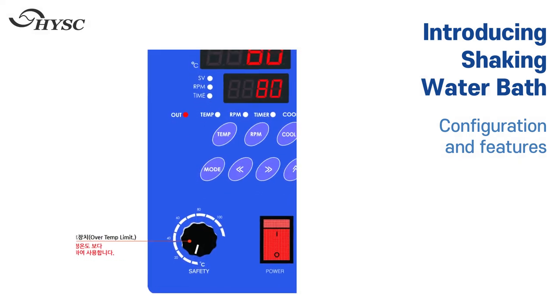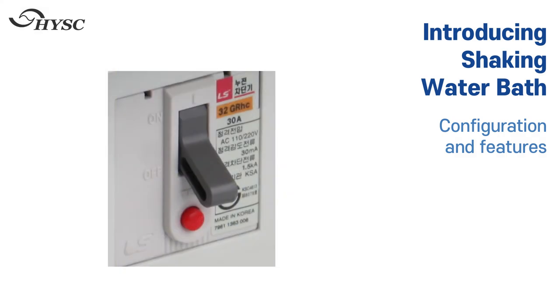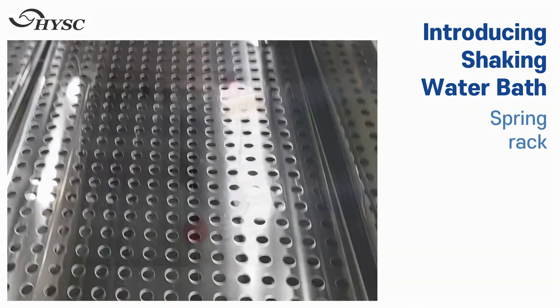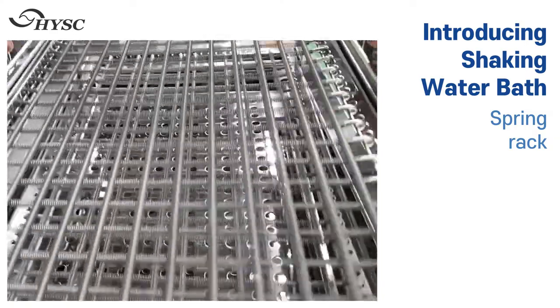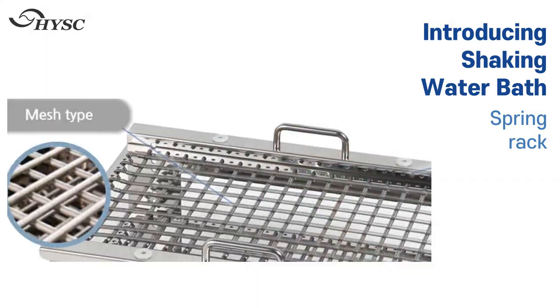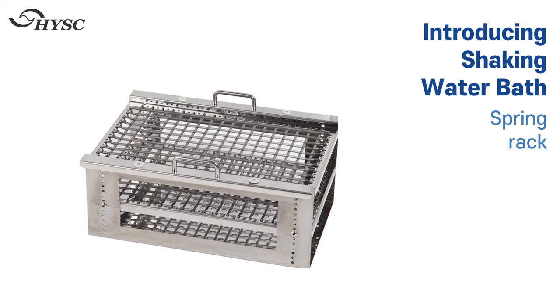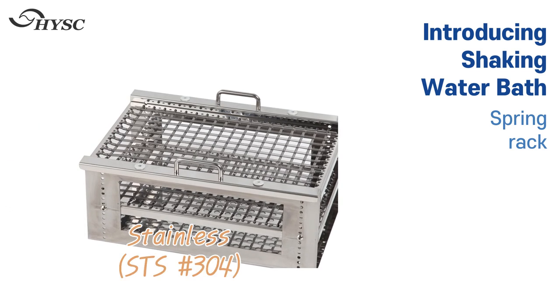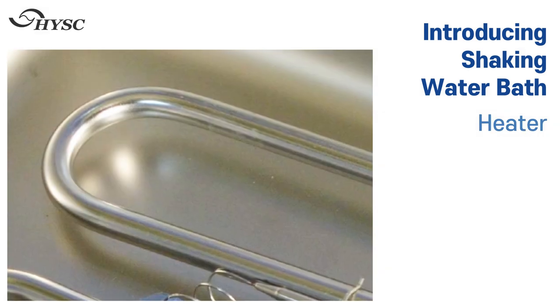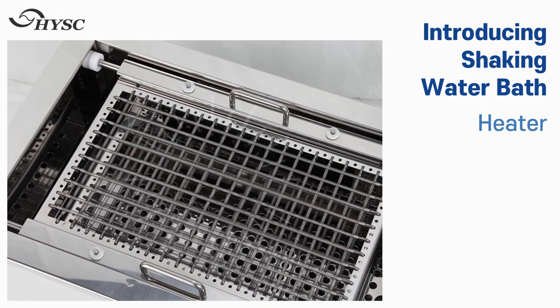An overheat prevention sensor is installed to prevent overheating. Ground wiring and ELB installation prevent leakage and overcurrents. The spring rack is easy to attach and replace, and the mesh-type spring rack is adjustable for space and position vertically. Stainless steel material ensures strong corrosion resistance and durability, with superior stainless steel used for the heater as well.